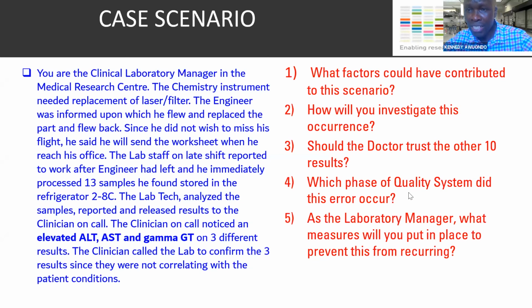Which phase of quality system did this error occur? We talked about 3 phases. So which phase of quality system did this error occur? We're getting answers that say the analytical phase. So that seems to be the predominant response, is the analytical phase.